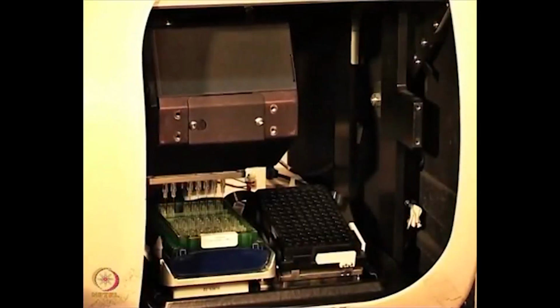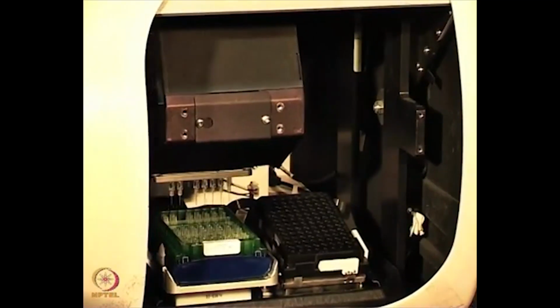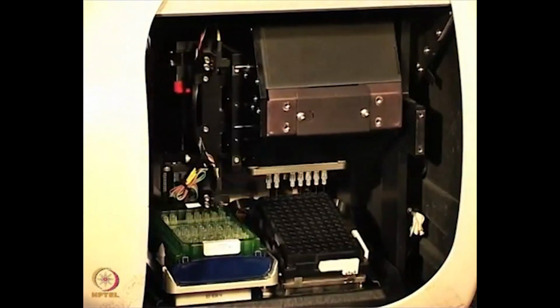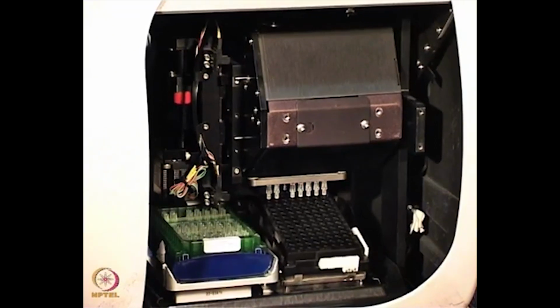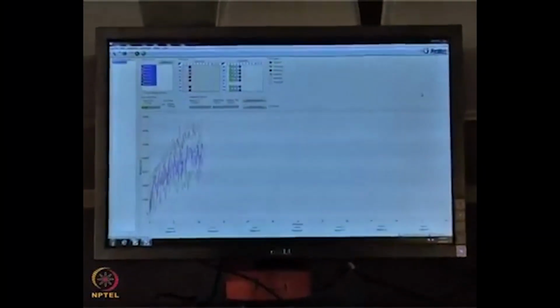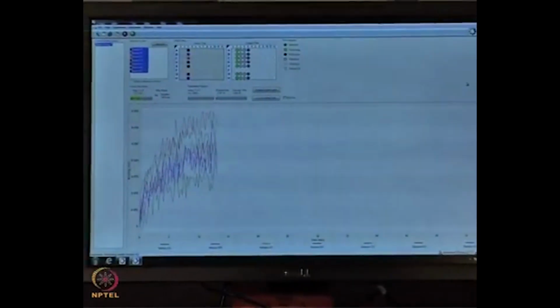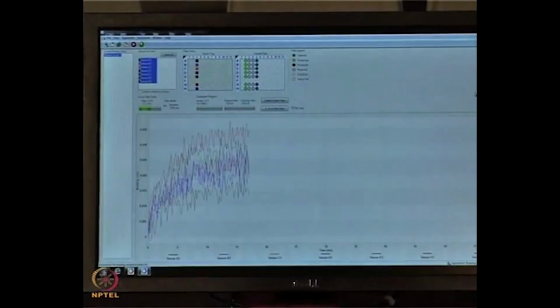The sensor is being picked from here, from the sensor rack. Now it is going to the sample plate. If you look at the sample plate, there is a shaker working at 1000 RPM. You can see that as it dips into the sample compartment, there is a signal. Now this signal we are acquiring for 30 seconds. The first step we call the baseline.